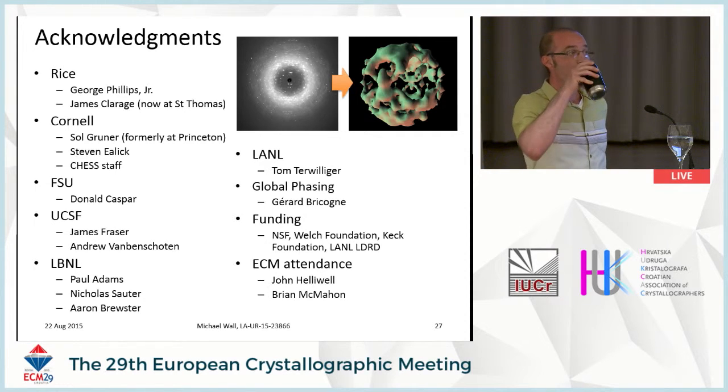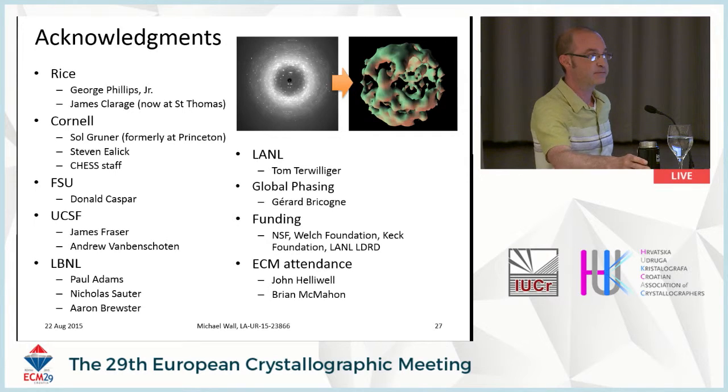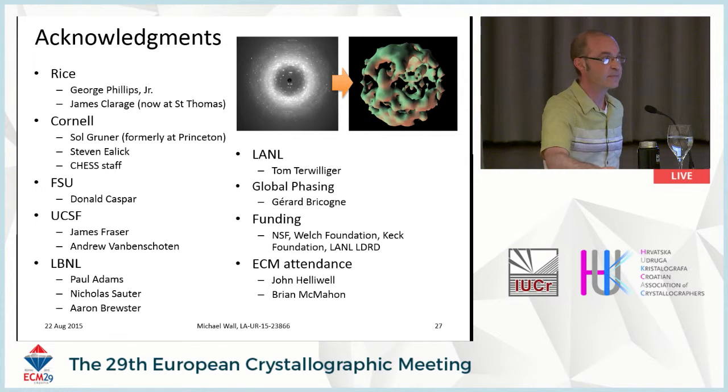Very nice, Mike. I have a question for you and for Vladek. So you mentioned the possibility of using a better understanding of diffuse scattering to get a better measurement of the Bragg peaks. And my question is, is it really plausible that the amount of understanding of the details of the shape of the diffuse density would be sufficiently structured in the region of a Bragg peak that it would actually be better than the current algorithms for just taking an average in a plane of density around the Bragg peak?